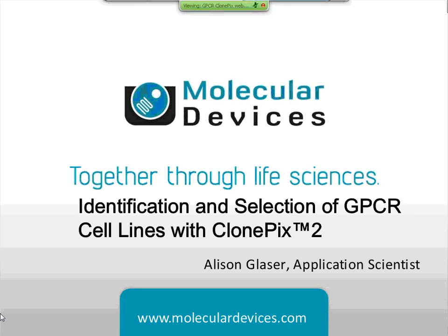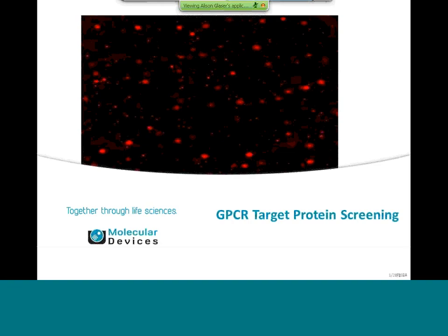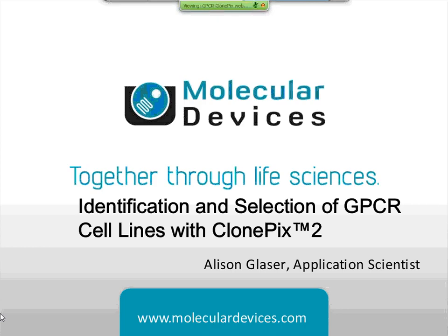Any other questions at this time? I also have one other question. Did you identify some of the highest GPCR expressors with altered or lowered growth rates? We didn't do an extensive study to monitor proliferation amongst the highest and lowest, but we didn't see anything that drastically was observing higher or lower growth rates amongst the expression levels, so no.